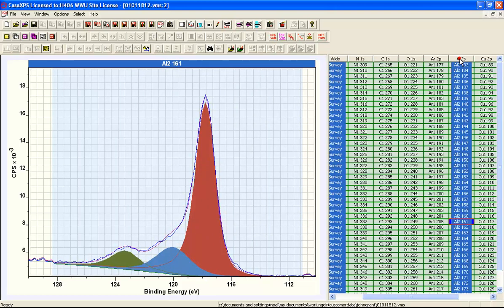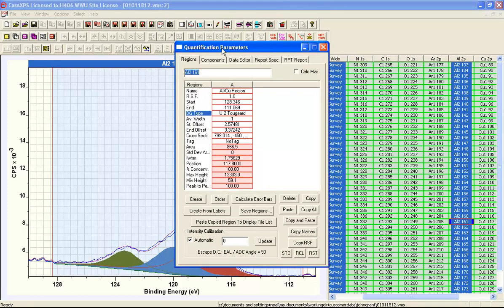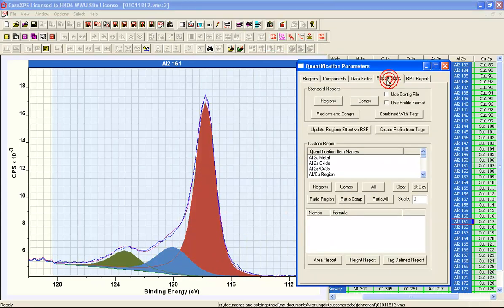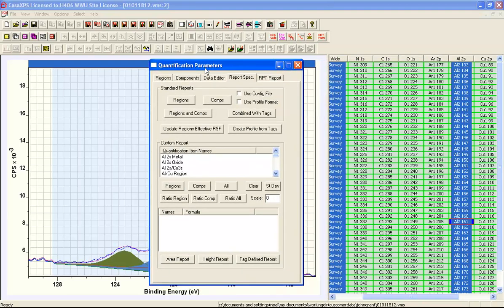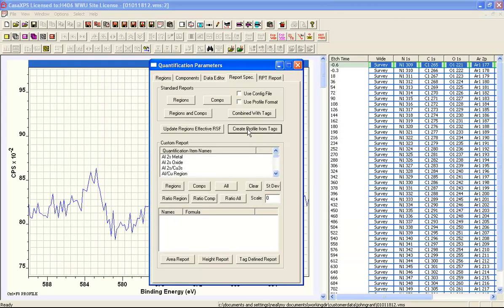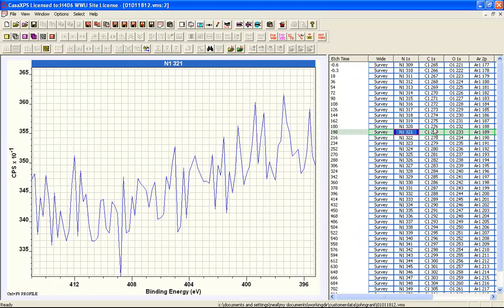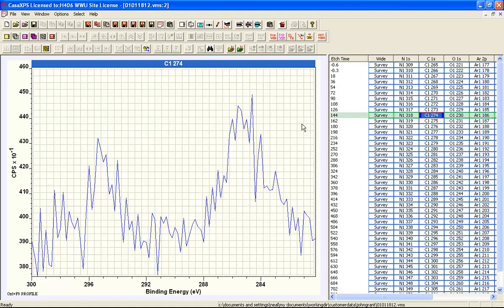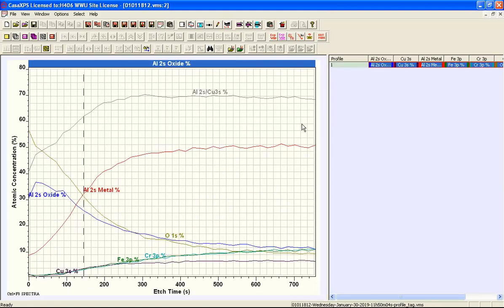Now we can perform a profiling operation based on tags. There is a new button on the report spec property page called 'Create Profile from Tags.' This applies to the selected VAMAS blocks. When we select 'Create Profile from Tags,' a new string appears indicating 'Control+F8 for profile.' This means that while viewing the spectrum file, we can press Control+F8 and rather than seeing spectra we see a profile gathered from these tags.